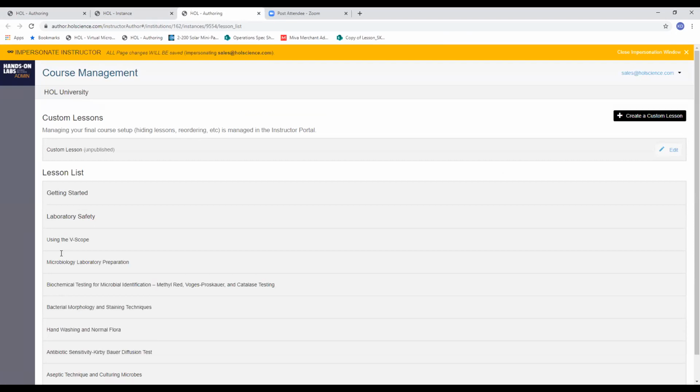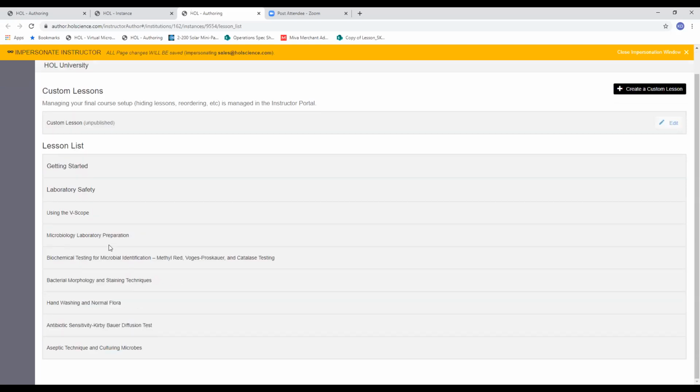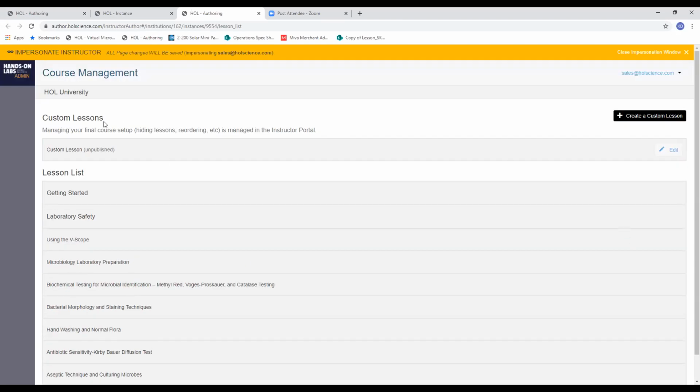Now, what we'll see on this landing page for the custom lesson authoring portal are the labs that are already in your course that we have placed there, and then the ability to create additional labs.